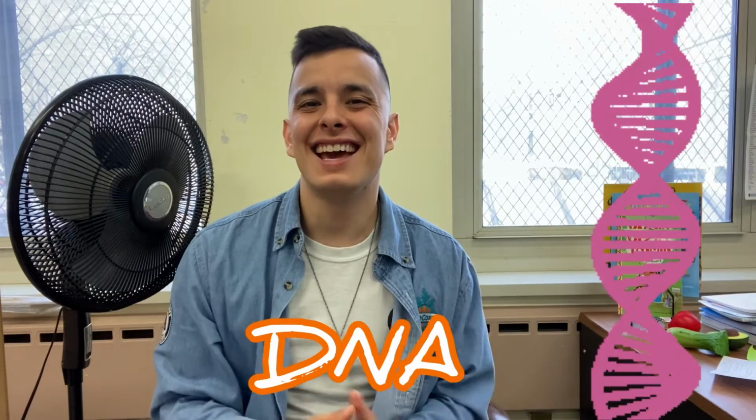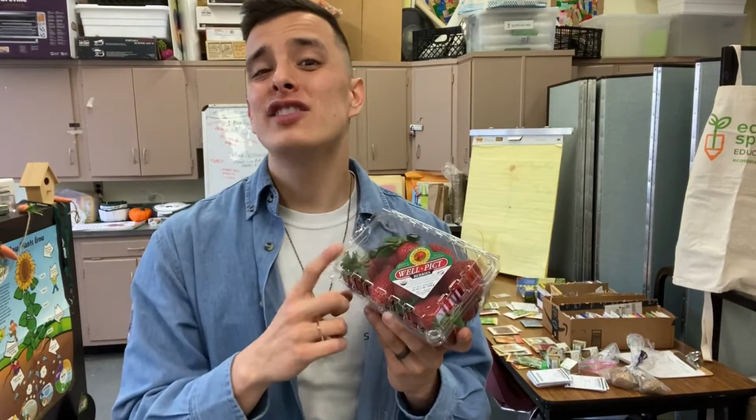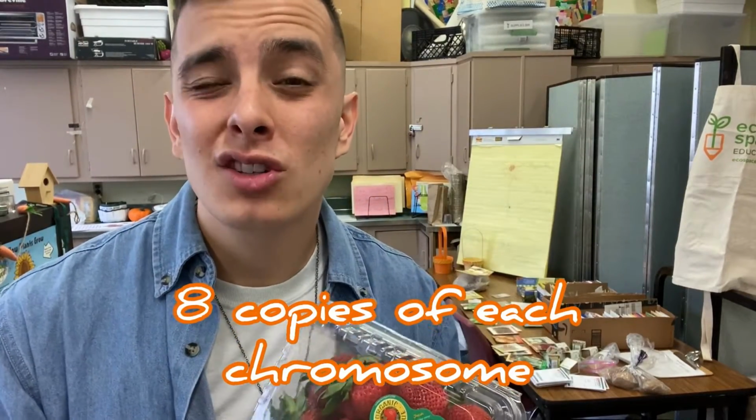And you're thinking, what is the name of this chemical substance? You've all probably heard of it before, but it's super simple. It is what we call DNA. And like I mentioned earlier, we'll be breaking down our strawberries to extract DNA. Now, strawberries are perfect for extracting DNA because not only are they easy to break down, but they also contain these enzymes called pectinases and cellulases that help break down the cell walls. And most importantly, strawberries contain 8 copies of each chromosome, so they have a lot of DNA to extract.